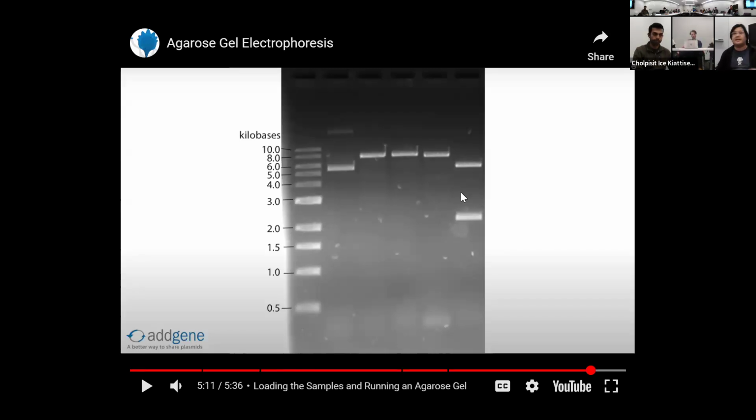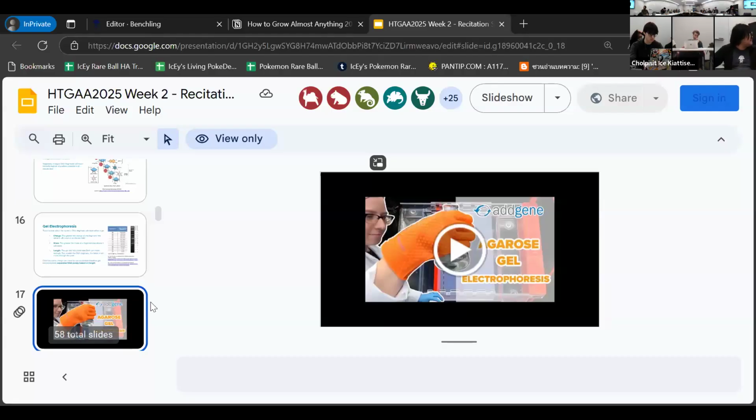We use blue light these days. In the past, like 20, 30 years ago, we didn't have that technology yet. So we may be using something that can get into your own DNA. We call them mutagenic agents. Try not to use them. It's a little bit scary.